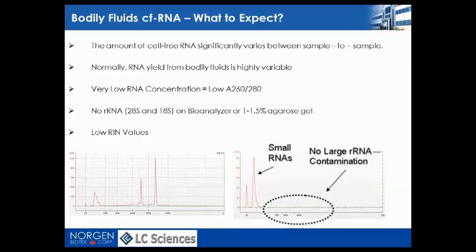So now, after extracting your extracellular RNA from your sample, what next? You will need to measure the RNA concentration and assess the quality of your RNA for either RT-qPCR for gene expression analysis, microarray, or sequencing. One of the main problems associated with circulating microRNA extraction and comparison of sample collectives is the quantification of microRNA. In contrast to isolated messenger RNA, where the size and relative abundance of ribosomal RNA can be used to assess the integrity of the RNA preparation, there is currently no good way to assess the quality of isolated microRNA. In addition, degraded messenger RNA can also interfere with the quantification of microRNA preparation.